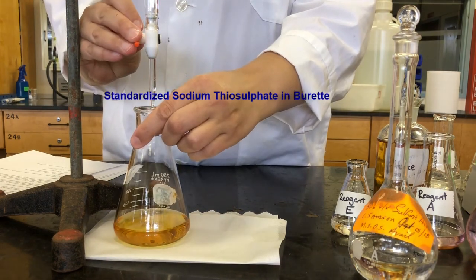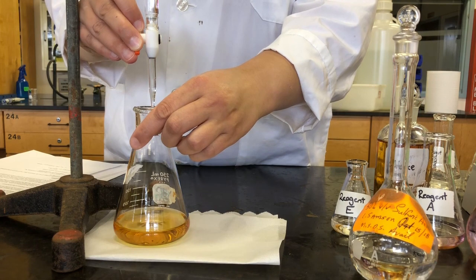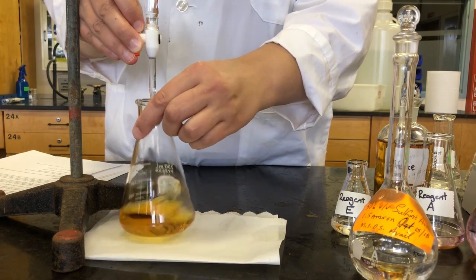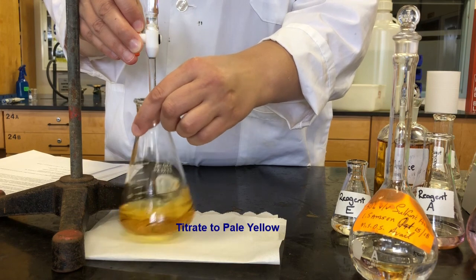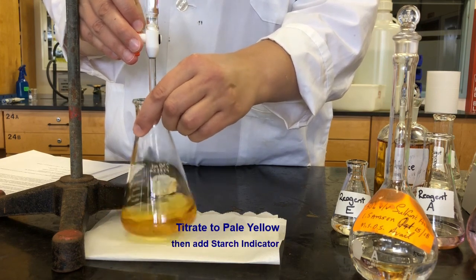So we'll start our titration. So what we're going to do with this titration is we're going to add sodium thiosulfate until we get a pale yellow color, and then we will add our starch indicator at that point before we continue our titration.